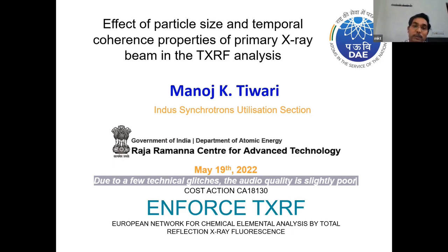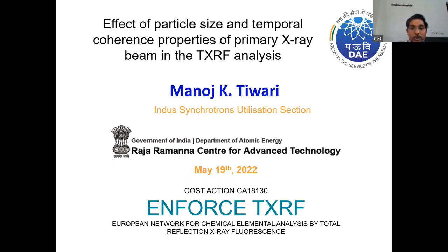So the title of my talk, we decided, okay, why not give the talk on the particle size and temporal coherence effect, the temporal coherence property of the primary X-ray in TXRF. So how the temporal coherence property of the source plays an important role in TXRF analysis, and how it affects the analysis. So let us move.